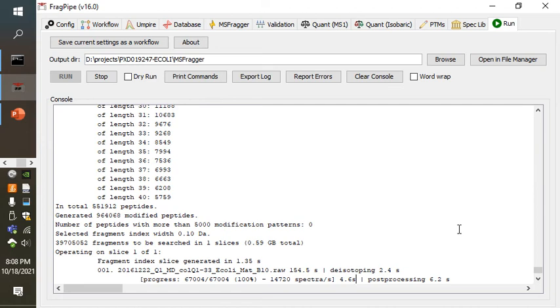All right, so for the first of the raw files, we see that there were 67,000 spectra collected. It's kind of amazing what new technology can do with these things. We're de-isotoping, which means that the fragments that appear in a given tandem mass spectrum are assumed to have different isotopic variants. That intensity is all getting shoved back into the monoisotope for each fragment. The matching process ran by very quickly, and the post-processing itself is pretty quick.